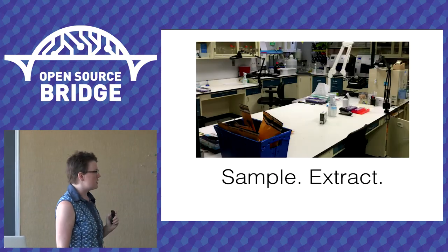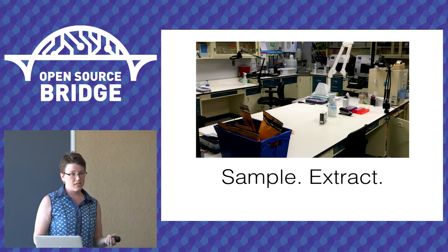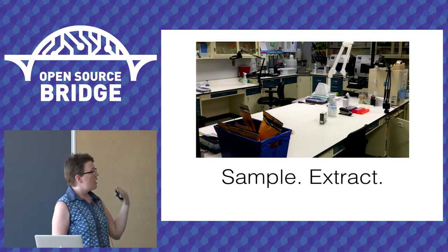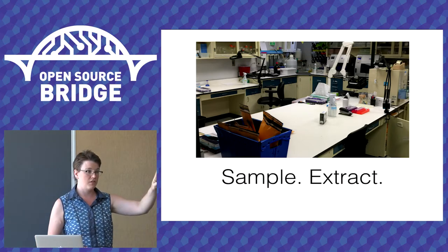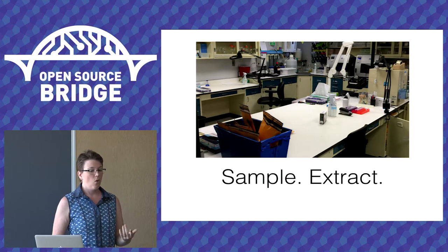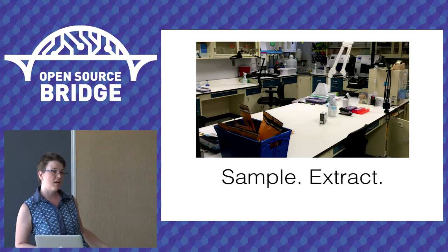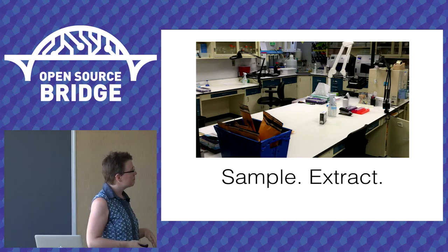So I receive this evidence, and one item at a time, I bleach down a surface, put on my lab coat and gloves, and look at the item of evidence. Then I either use a swab to pick up any cells that are on it, or if it's something like a piece of clothing with a blood stain, I'll just cut out a small piece of the fabric, about 5 millimeters by 5 millimeters.